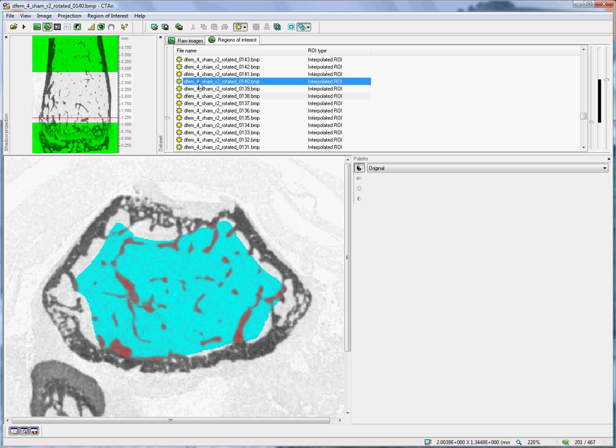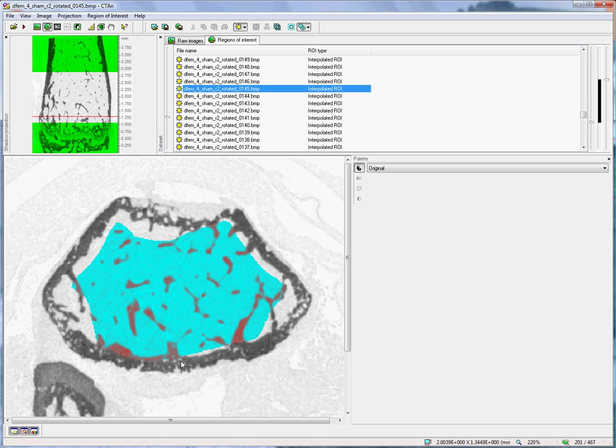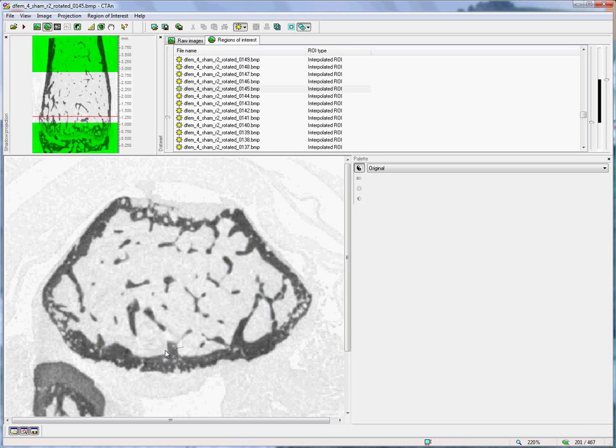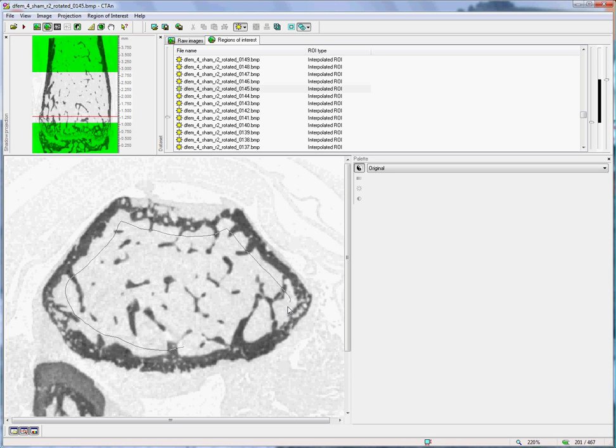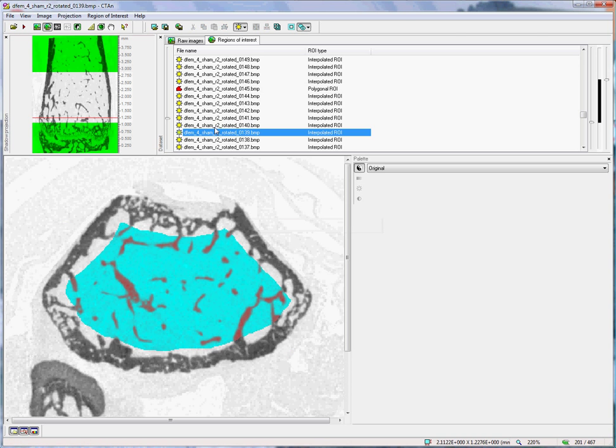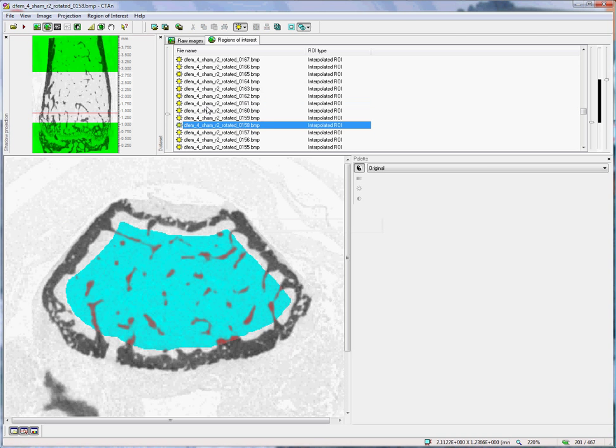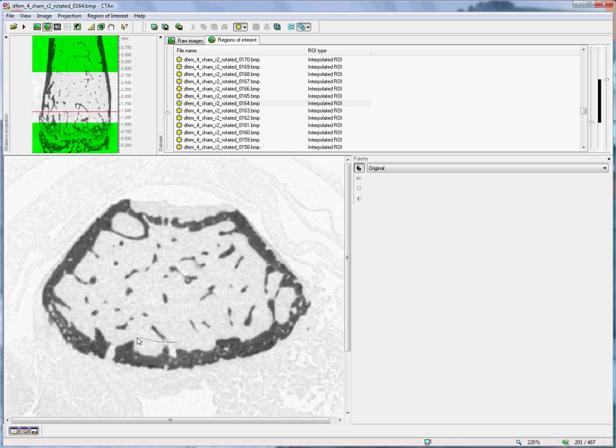Then I move up, say 20 or 30 slices, and draw another shape. The program will interpolate between the shapes that I draw to produce the three-dimensional volume of interest of trabecular bone. With a little bit of practice, this drawing process becomes quite fast and straightforward.